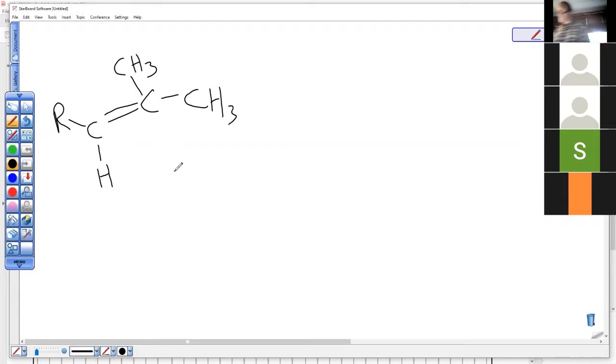Okay, so the NMR data for the carbon in the middle said that it had 6 neighboring hydrogens. I was wondering if it had a double bond to a carbon, that wouldn't be considered a neighboring hydrogen. Now there's no situation where there's 6 neighboring hydrogens here, because the neighboring carbon here has no H's on it. I don't know what's in R, but with what we have here, this would be a singlet because it has no neighbors.